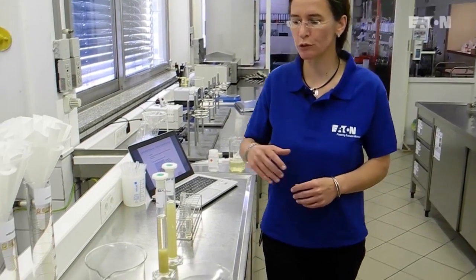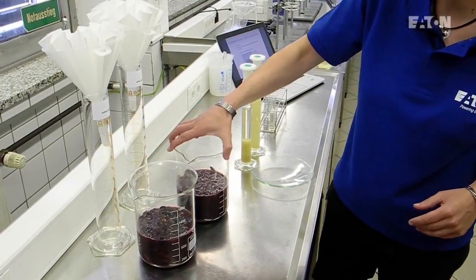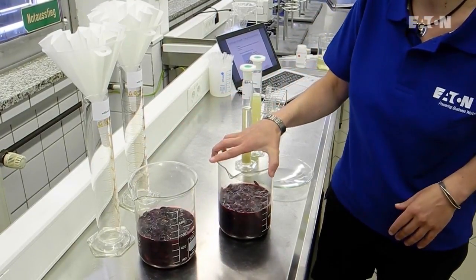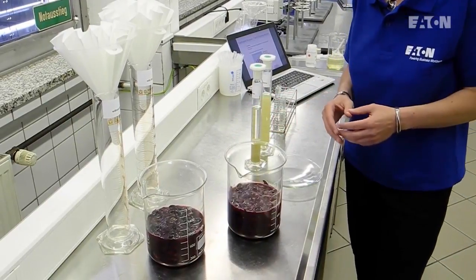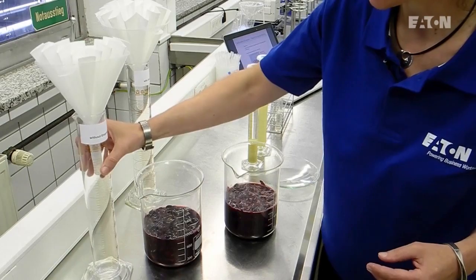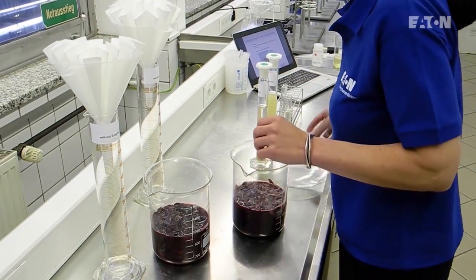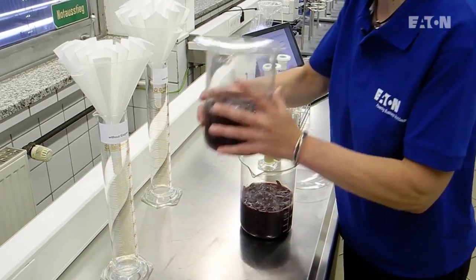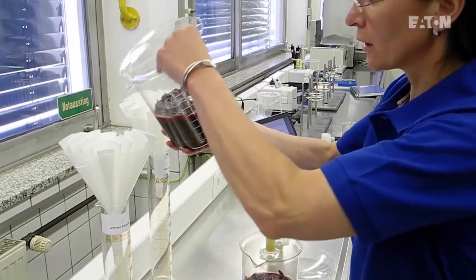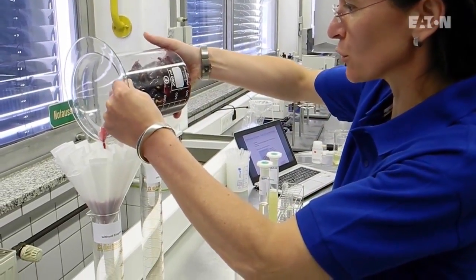The next step where to use an enzyme in a winery is during mashing. We have prepared two different samples: one is a red grape mash without an enzyme, and the other is with an enzyme. You can easily compare them using a drop test — we take some filter paper and pour the liquid fraction of the grape mash onto and over the filter.